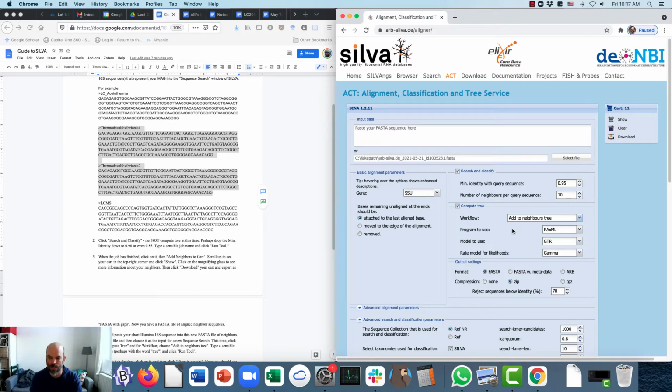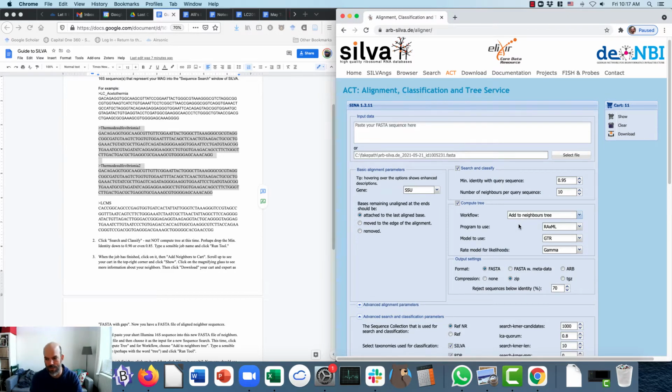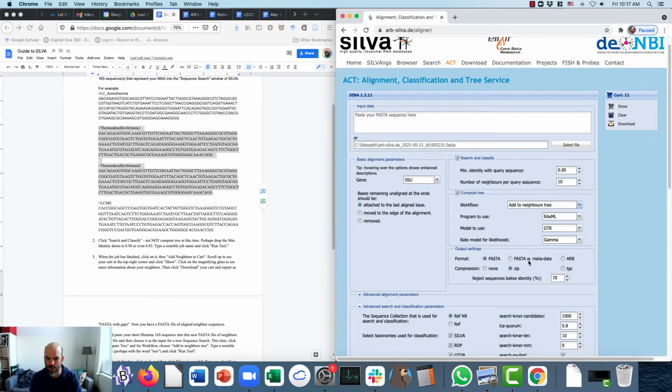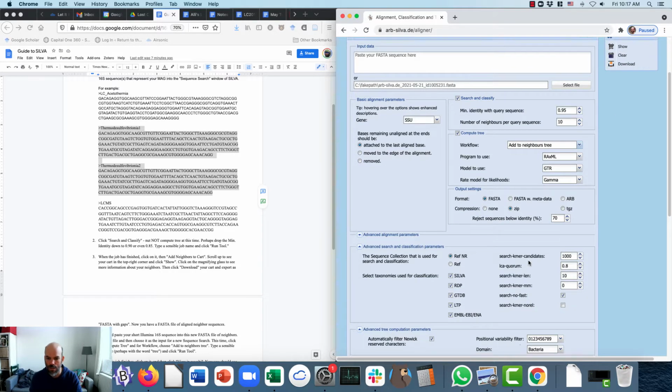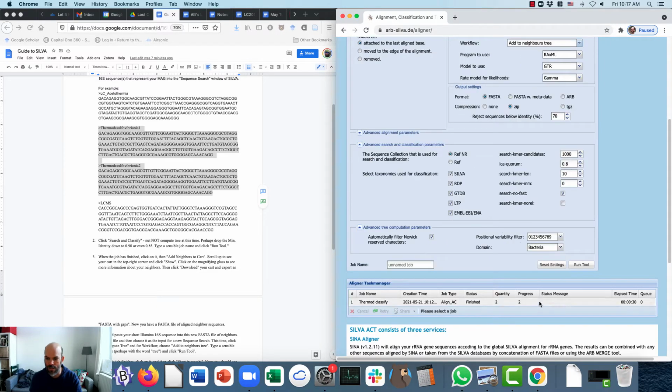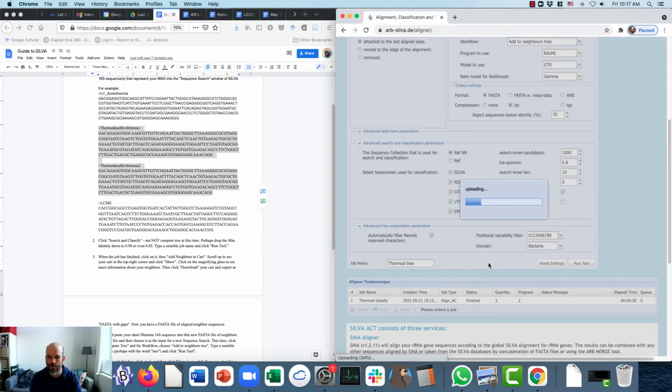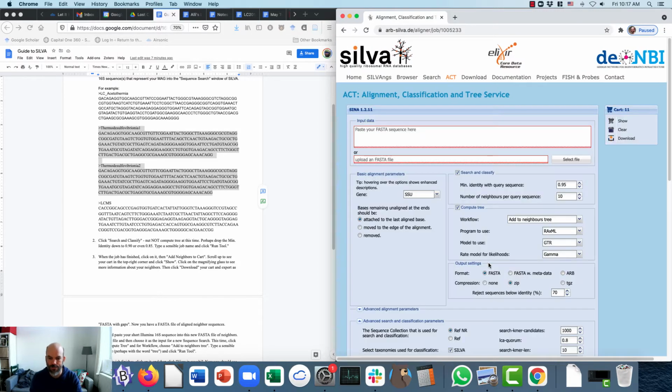If we construct a de novo tree with the short sequence, bad stuff could happen. Okay, all of the rest of this is fine. The only thing to take a look at is here under domain. If you know you have an archaeal sequence, you should change this to archaea. Otherwise, it's all good. We want to give it a good name. So this time I'll call it thermod tree, run tool, wait for it to finish.